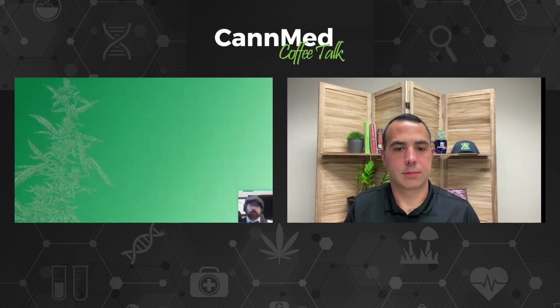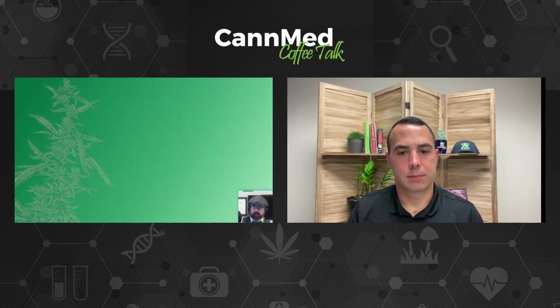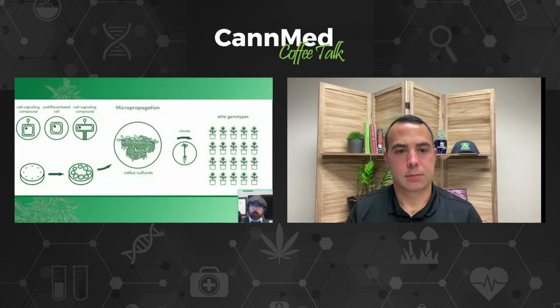So, the basic process of tissue culture is first you do a selection of materials: you select a plant and you select the tissues in question. Then we'll pull up this cartoon.